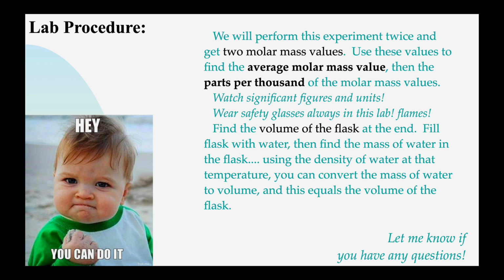So it's pretty cool. That'll be the last thing you do. It does make the round bottom kind of wet, so you have to dry it off. That's why we wait until the very end. Okay, if you do have any questions, of course you can ask me. There's no dumb question, that's for sure. So please let me know.